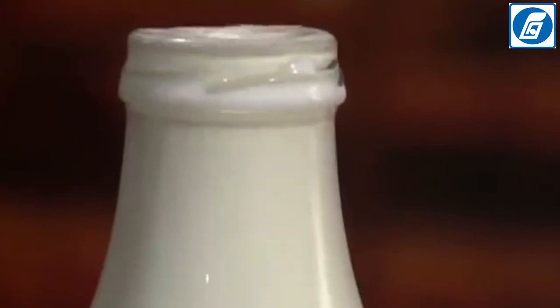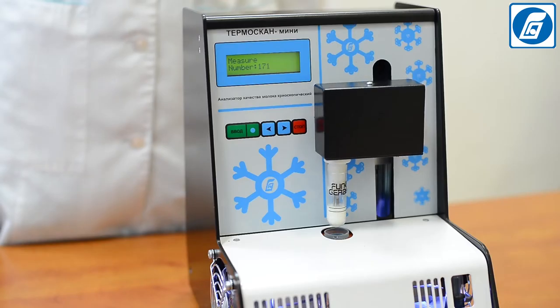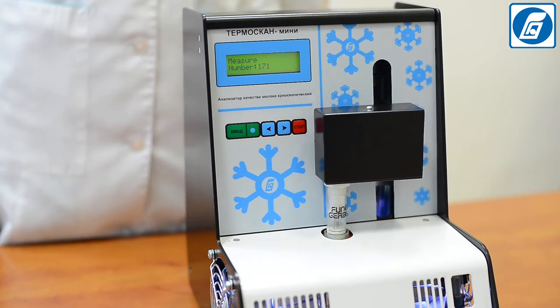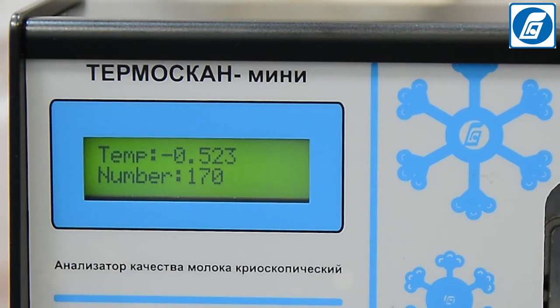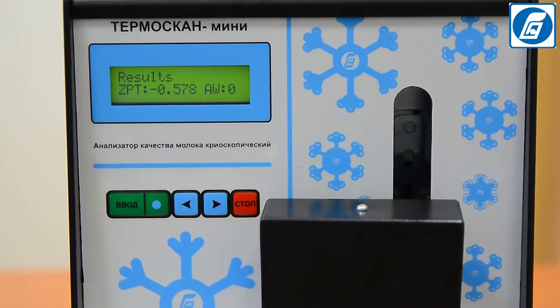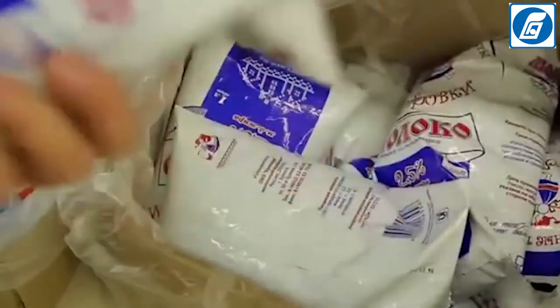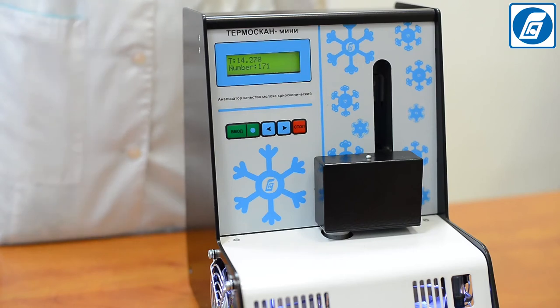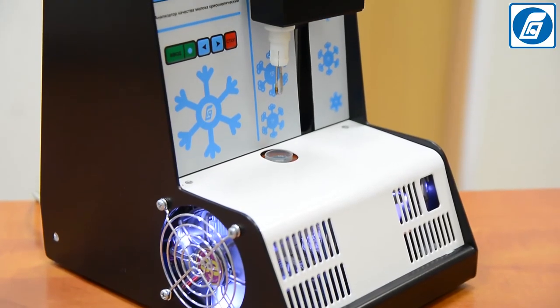Analysis of the main quality parameters of milk — such as fat, protein, and SNF — in adulterated milk may not help identify adulterations. However, freezing point determination using the direct freezing method allows for identification of additional manipulations or adulterations in milk. We can see that in this case the freezing point has shifted downward from the standard value of minus 0.52 degrees. Only by controlling the quality of raw milk at the input — when milk is received from producers — can we guarantee high quality of the finished product. Temascan Mini Cryoscope installed at a milk collection point will allow receiving information about milk quality and detecting possible adulterations before milk goes into processing.